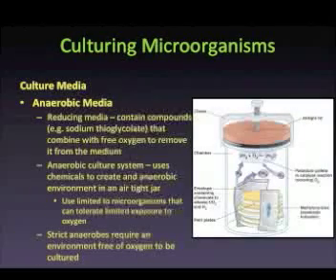Another method of creating an anaerobic environment is to utilize an anaerobe jar. Anaerobe jars are containers with tight-fitting lids that prevent oxygen from entering. After the inoculated plates are placed in the jar, water is added to a full packet, and the lid is placed on the jar. The water reacts with the chemicals in the packet to produce hydrogen and carbon dioxide.